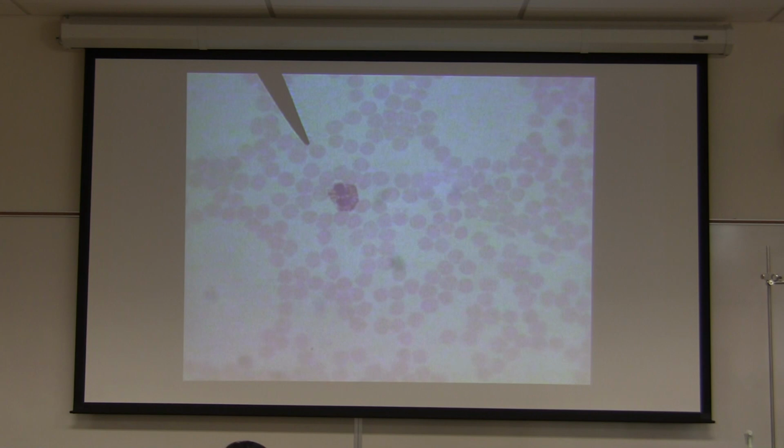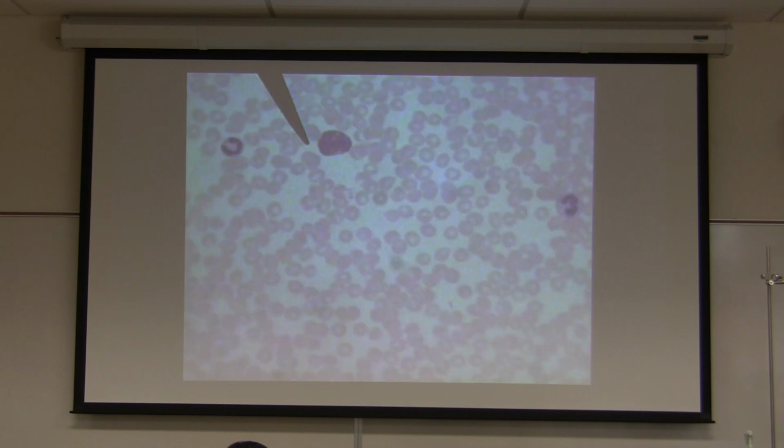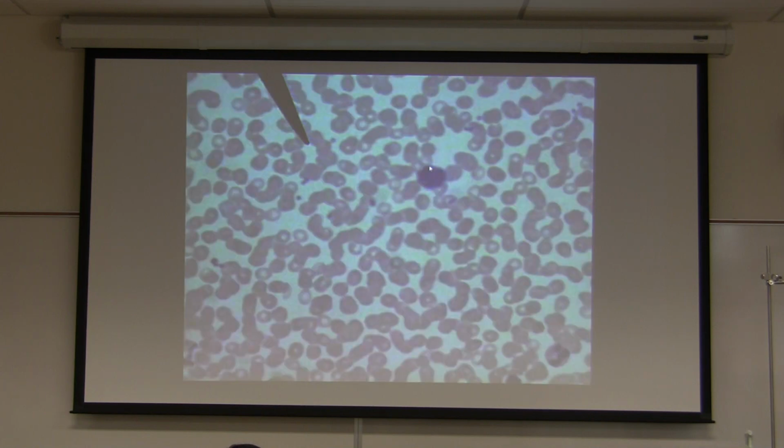Cardiovascular, vascular system, red blood cells. You know that. Okay, again, that's an eosinophil. The nucleus is purple, but the granules inside are red. This is a neutrophil, eosinophil. Here is, again, the microscope will not focus on me, but the granules, I don't know if you guys can make it out or not. I can see it better here. Right here, the granules, they're dark.